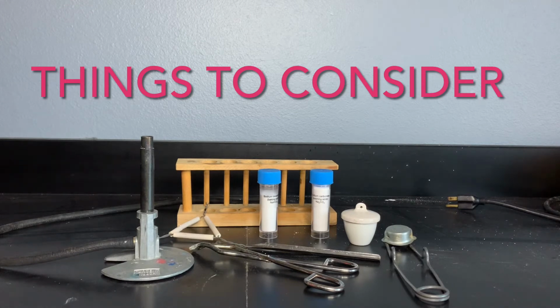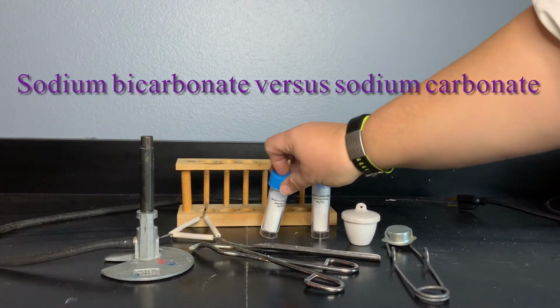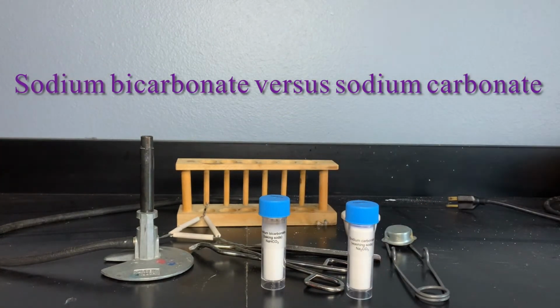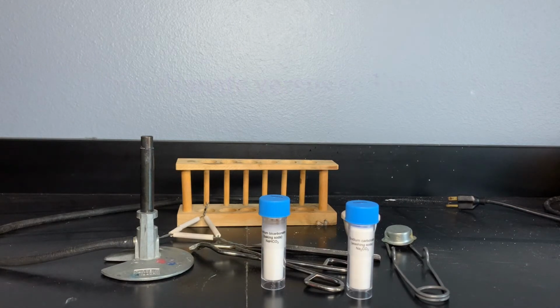And in your lab, I've included a little bit more background information for you about things to anticipate with this decomposition reaction. So I'm going to have you working with two substances. We're going to be working with sodium bicarbonate, and we'll also be working with sodium carbonate, because sometimes you'll have a question of, well, what's the difference between the two? So we'll be performing an activity on A and B of the procedures to look at that, and then day 2 will involve the use of the crucible.